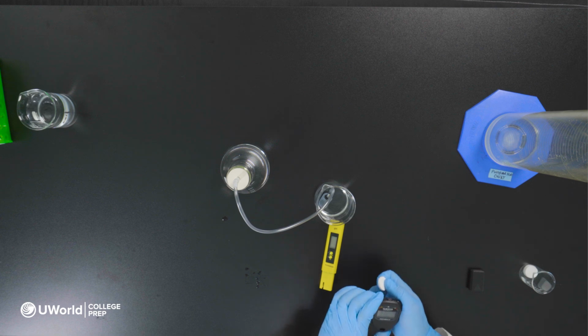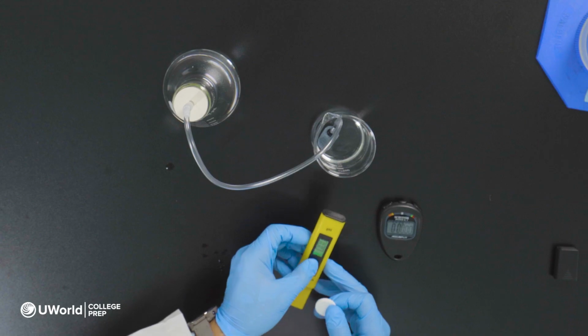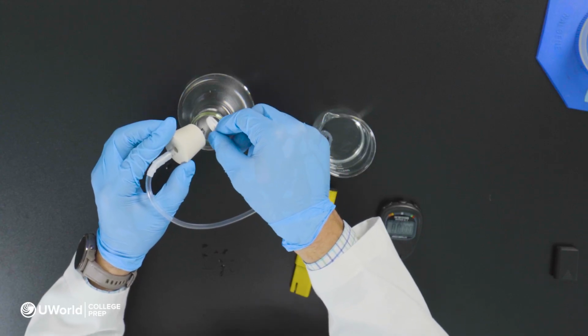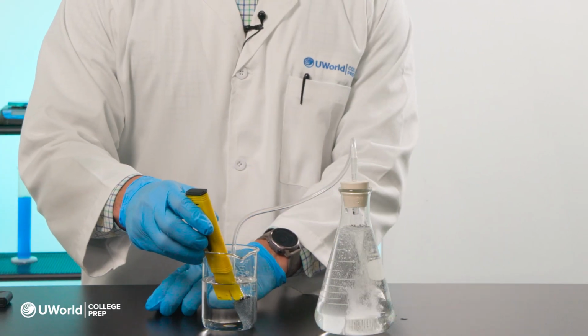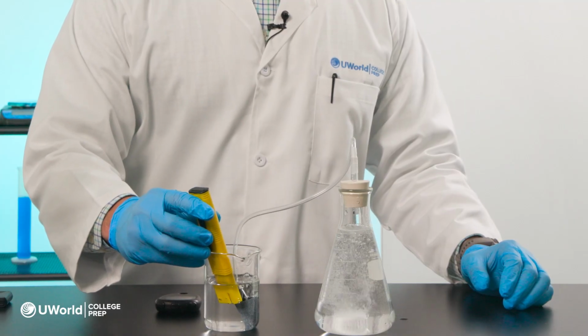So we have our stopwatch reset. Everything is ready to go. Our pH meter is on. We are going to drop this effervescent tablet into the flask and quickly cover it. We'll measure the pH again for about a minute, and then we will take out the samples.